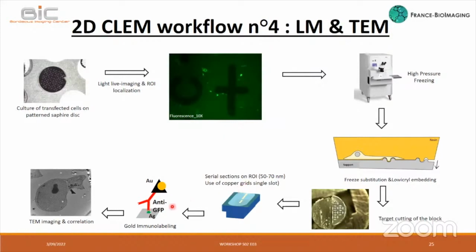After section, gold immunolabeling in post-embedding was made using gold beads of between 5 to 15 nanometers, and an observation in TEM for the correlation.